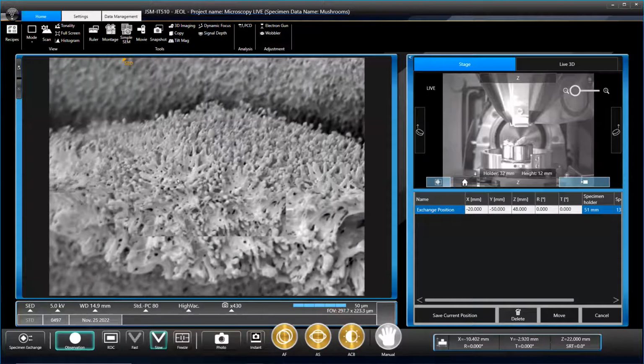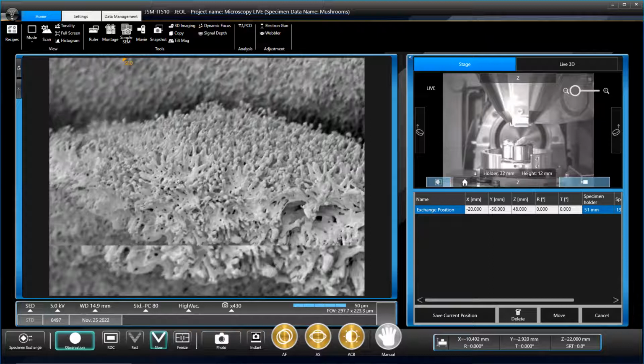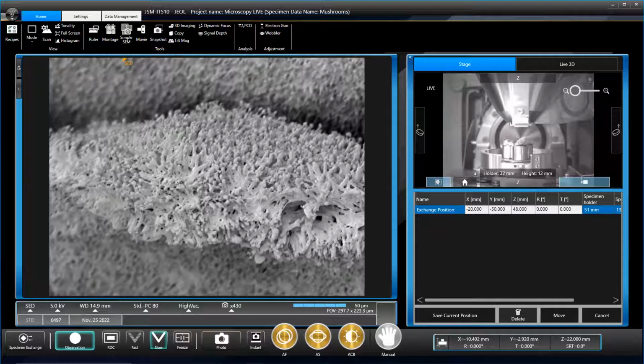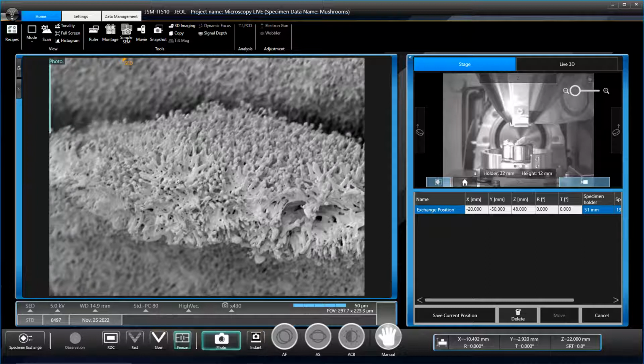It looks like that's curled up a bit. So yeah, that centre bit is fine. I think the texture makes it more difficult as well because you've got so many dimensions. So trying to focus a bit. What we can also do is take a photo of this. You just follow the electron beam by a little blue line in the corner. That'll save it as a TIFF file, so it gets all the metadata as well. Not only will everyone who registered for the Zoom call get all the data, you'll get all of it as well.